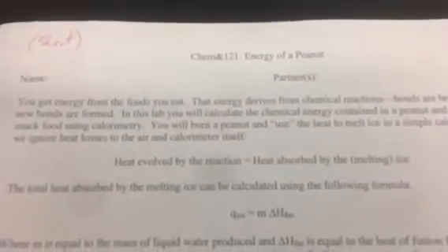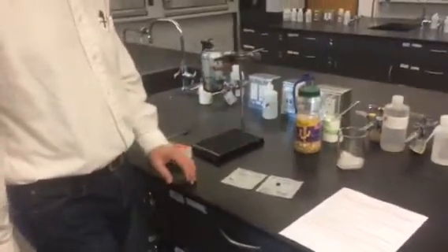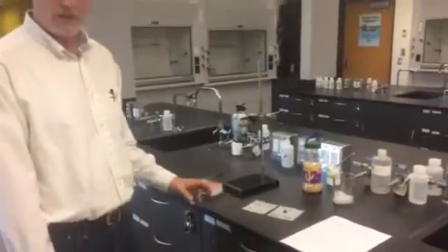This week's lab is on the energy of a peanut. We're going to explore thermochemistry, the energy of chemical reactions, and this week we're going to see if we can figure out how much energy is contained within a peanut. In order to do that, we're going to burn the peanut.